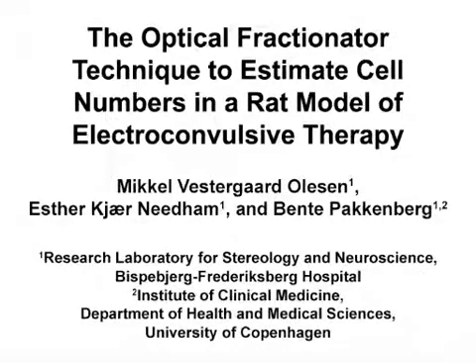The overall goal of this stereological study using the optical fractionator is to obtain quantitative information, such as the total number of cells in a specific brain area, using methods based on unbiased principles.